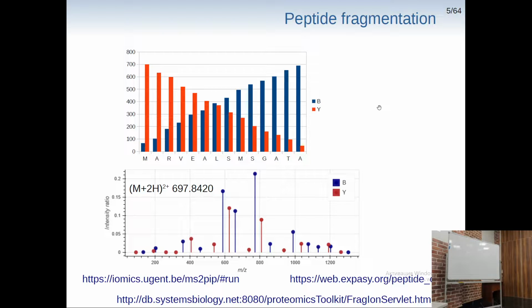What do you think about charge? Is there some preference for charge to move during this fragmentation phase? If you, for instance, have some basic amino acids and acidic amino acids, and you want to get those ions which have excessive protons. Right, absolutely.